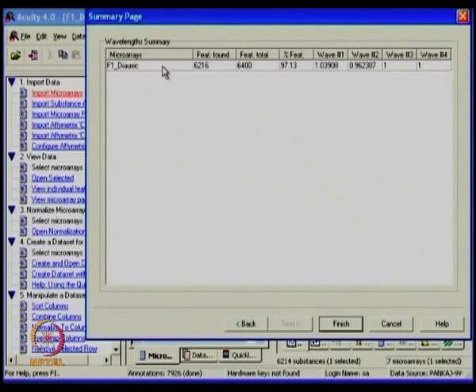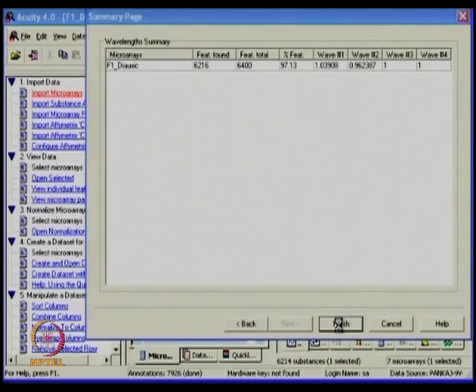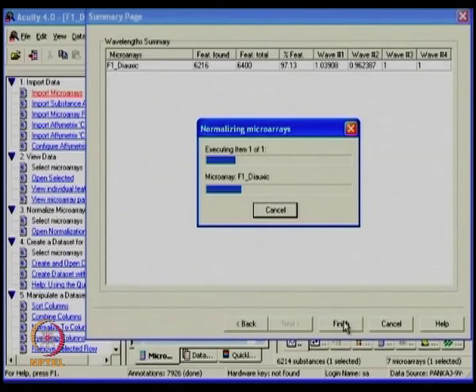It shows that okay, it is available for me, it's being done, and I can say finish, which means I have finished my normalization. If you carefully look back, the purplish spots will change to red, which allows one to understand that yes, all my images are now normalized in a similar fashion. I guess we are dealing with a lot of data here, so it takes some time for processing the whole thing.